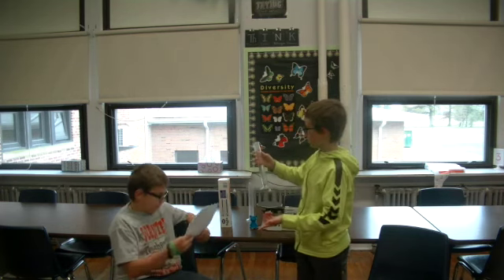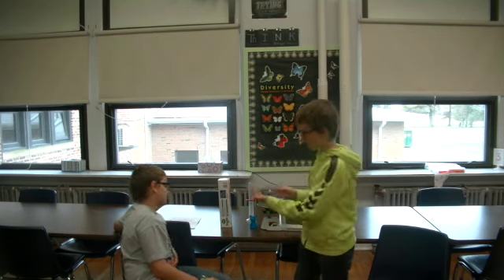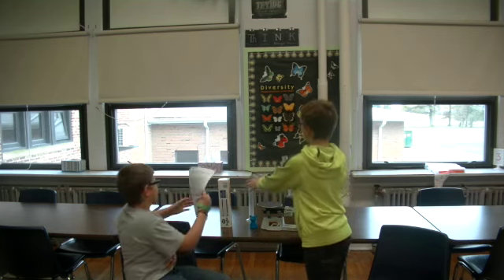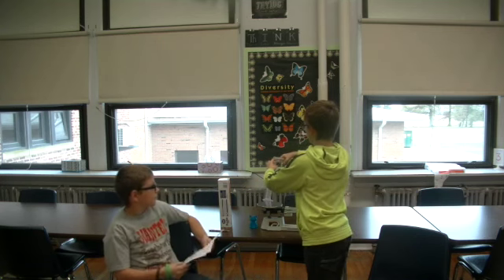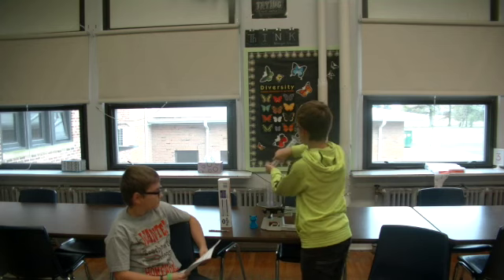Remember, there were 69 milliliters of water in the cylinder before. 71 minus 69, which would be 2. Yeah, so you did it. Okay. And then we would carefully take it out. Go like this. Boom.